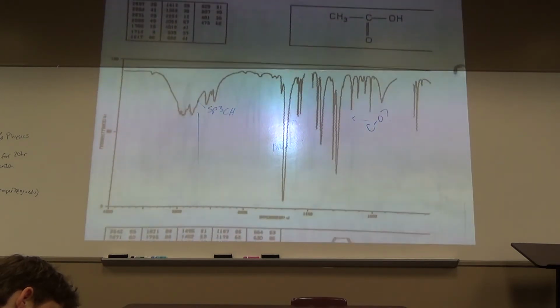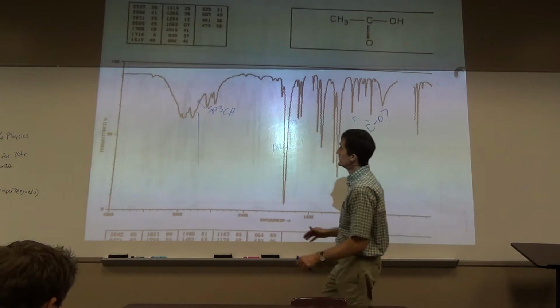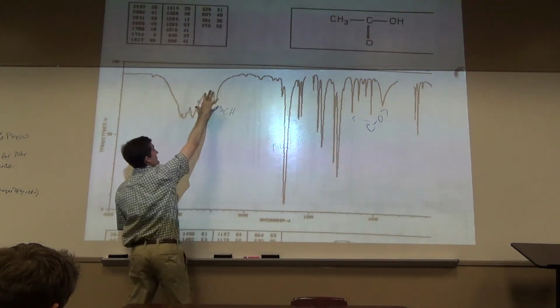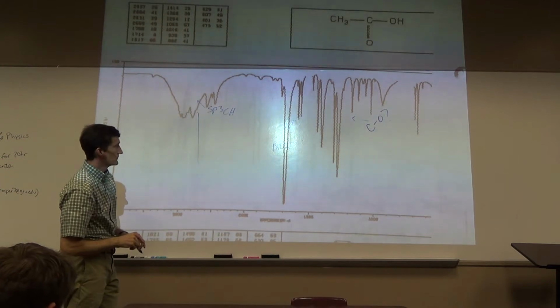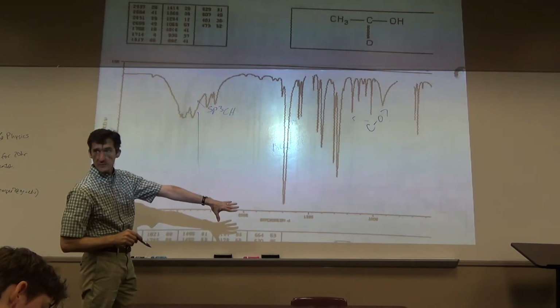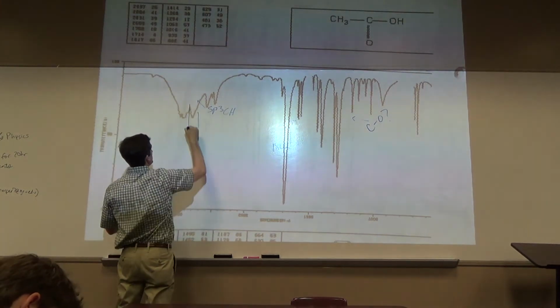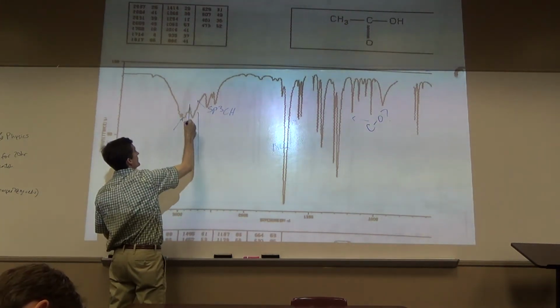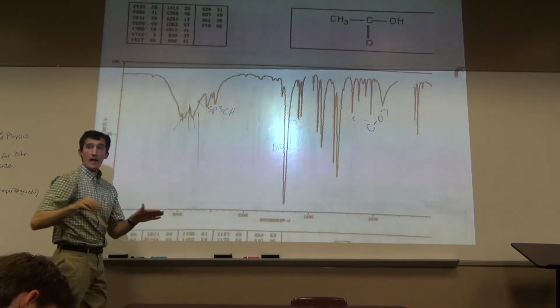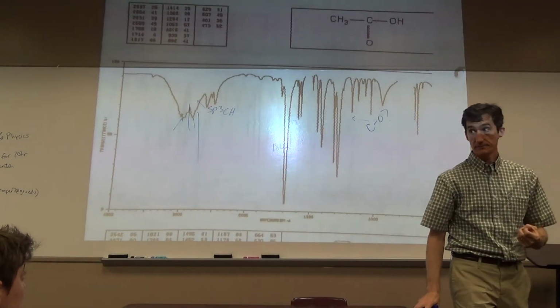One below, I'm not going to write anything on the board, but I see some broadness over there, though it's certainly not as intense as the one above. So you see some broad there. Structure is not shown. Carbonyl. The structure, I think, has an aromatic ring with sp2 CH, but it also has some sp3 CH. So sort of both sides. So here and here, sort of trying to get some peaks. At the same time, it's doing the broadness. The broadness is due to extensive hydrogen bonding.